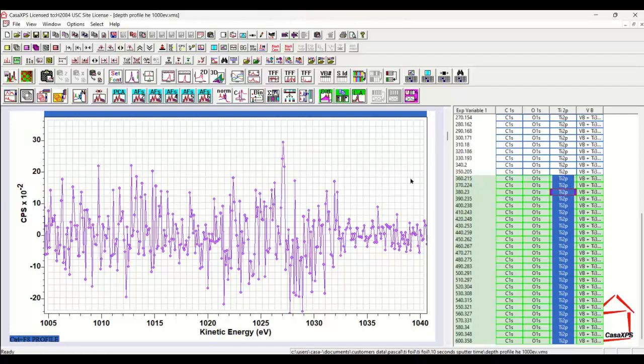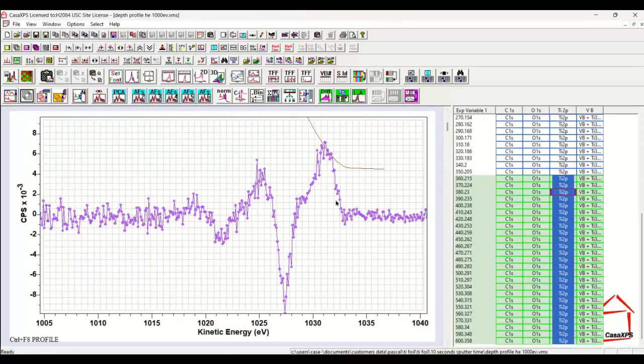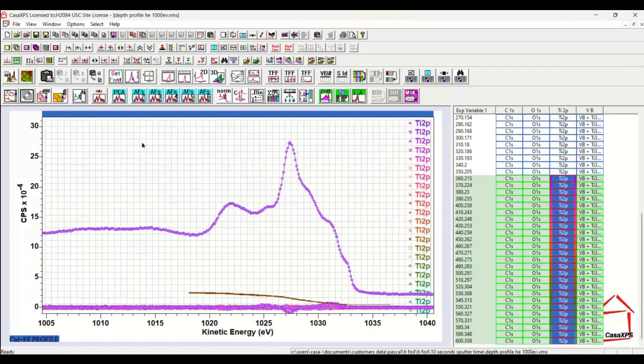So there are only two abstract factors that actually make sense in terms of spectroscopy. The first one is mostly like the average. The second one is telling you what's different from the average in these data. Some proportion of these two different abstract factors will be necessary to reproduce the data that we see here, and if we use two, we've mostly removed noise. That would be one of the reasons why we would do this.